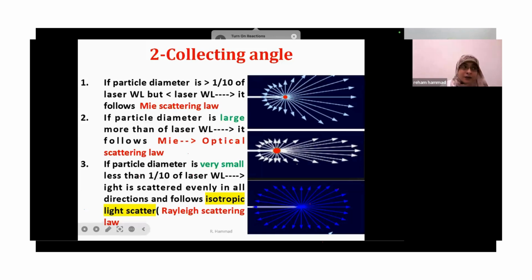In the first pictures, on day zero, which is before the CAR T-cell therapy, there is disease. After 1 month, we can find a very good response in the metastatic medulloblastoma or ependymoma. And at the end of the study, we can find two pictures showing a recurrence, but the other picture showed complete remission, which is a very good and promising result. The same goes for the scattering: if you collect the light at an angle of 180 degrees, the intensity is going to be higher than situating it at 90 degrees.